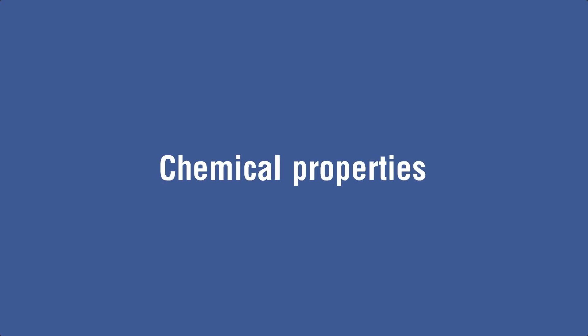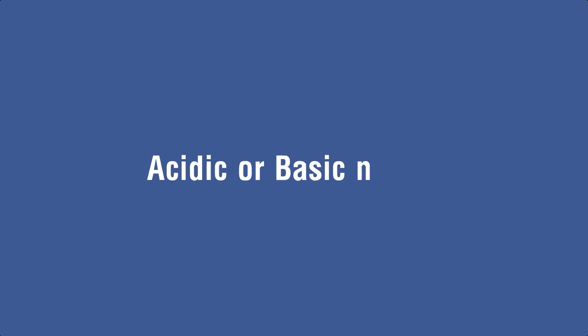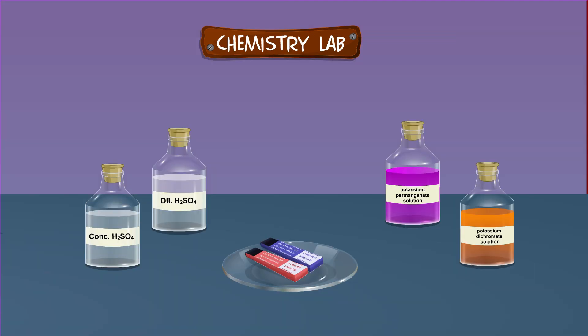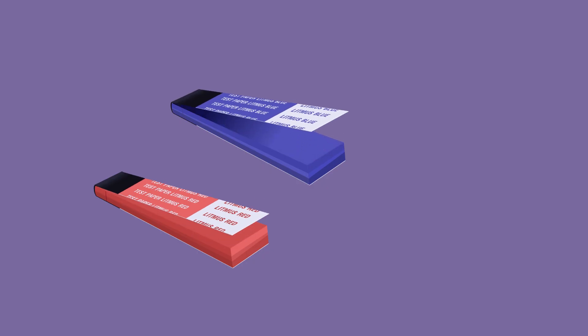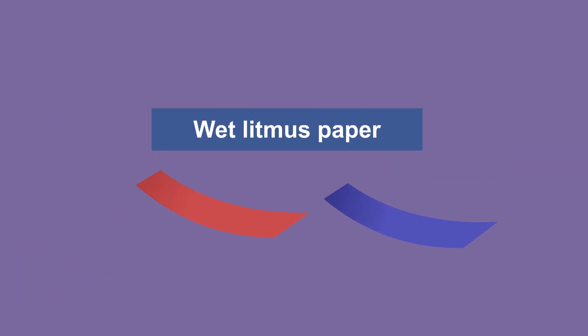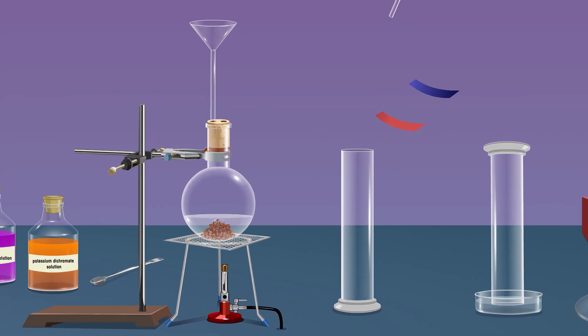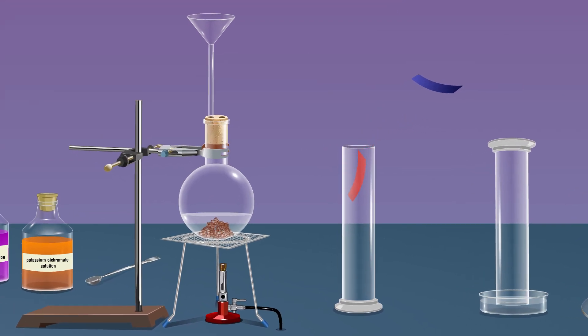Let us move on to study the chemical properties of sulfur dioxide gas — specifically its acidic and basic properties. Place the second gas jar and connect it to the delivery tube and wait till the gas gets filled. Then dip the wet red litmus paper into the gas jar. We observe that there is no change in the color of the red litmus paper, and we infer that the sulfur dioxide gas is acidic.